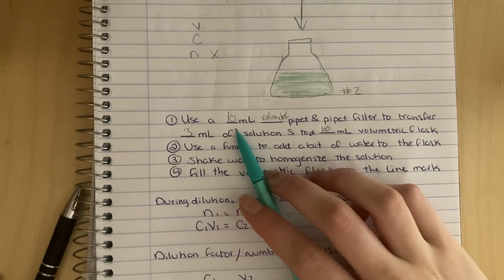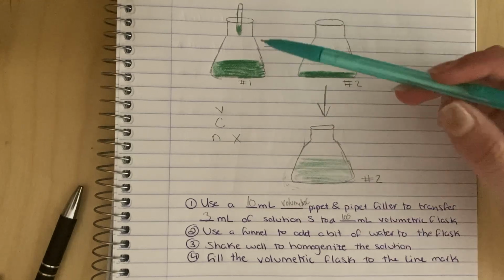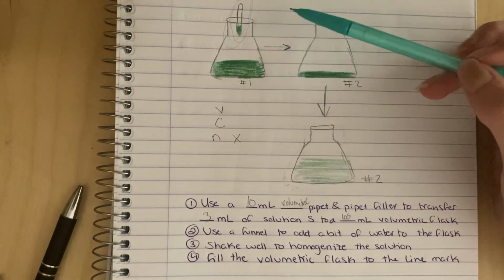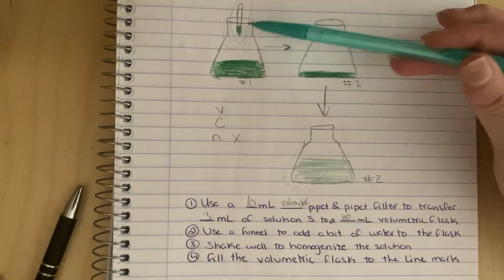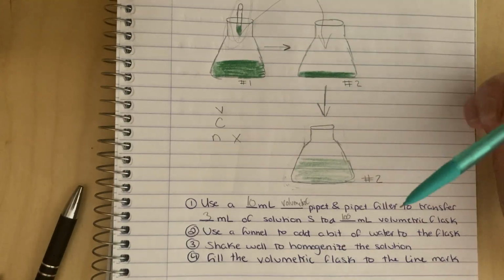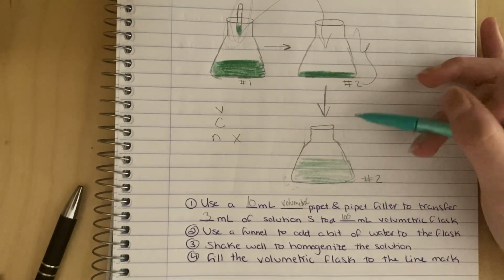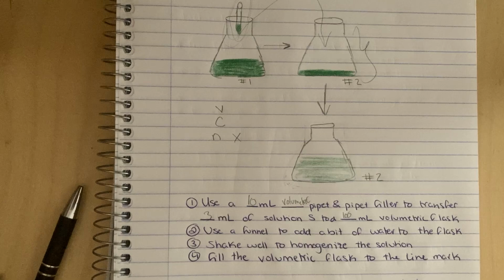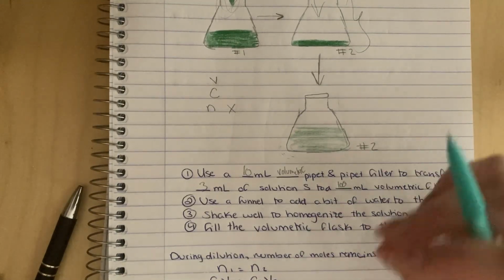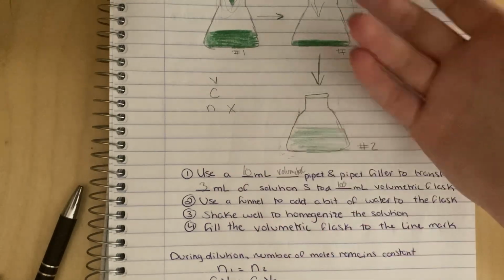So, as you can see up here, let's call this a 10 milliliter volumetric pipette. You use it to transfer 3 milliliters to a 100 milliliter volumetric flask. So this volumetric flask, in this case, is 100 milliliters, and we have 3 milliliters of solution S in it. Then we use a funnel to add a little bit of water to the flask. Then we shake it well to homogenize the solution.